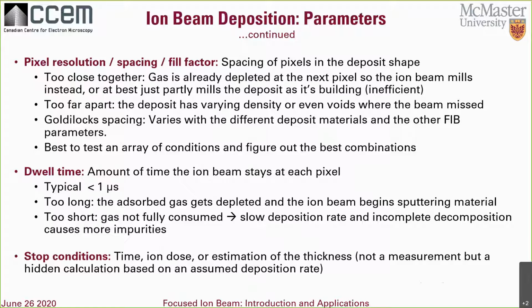Okay, during cryo lift out, is the needle also at cryo temperature? As far as I know, it's not. Maybe there are some unique microscopes where that is possible. But cryo lift out is also very difficult because you can't do deposition when it's cold. The precursor gas doesn't work. You just get a big mountain of the gas and won't be able to decompose it.